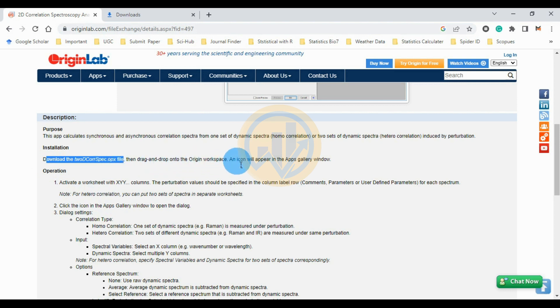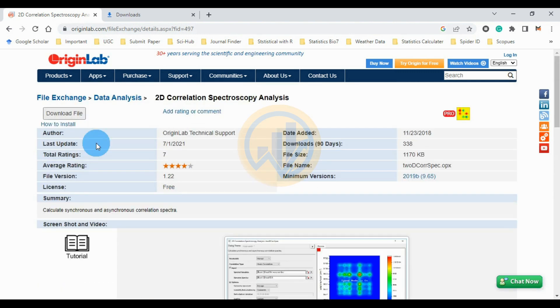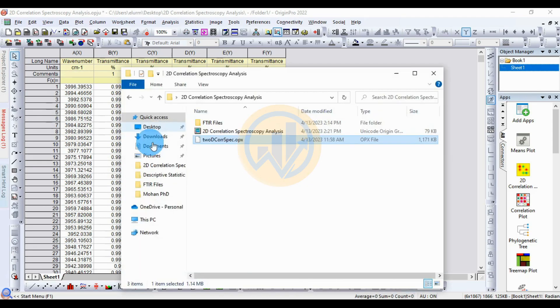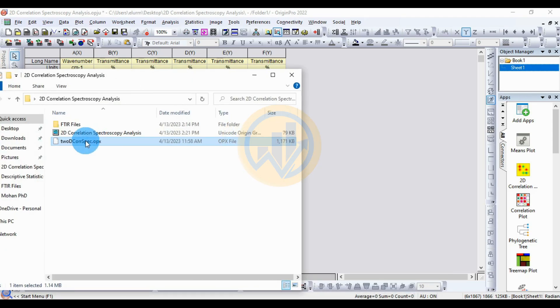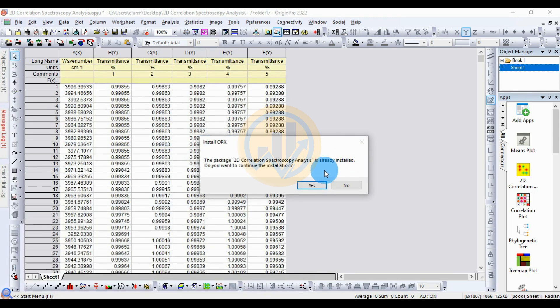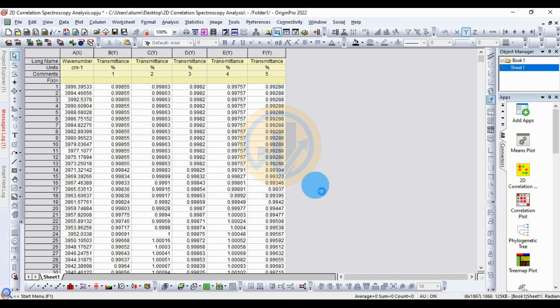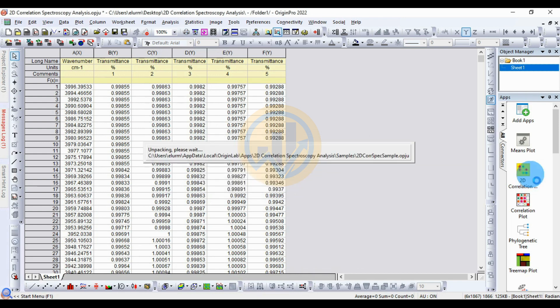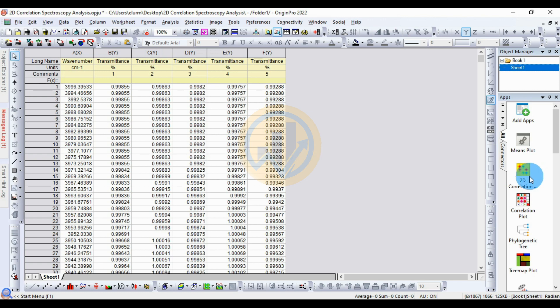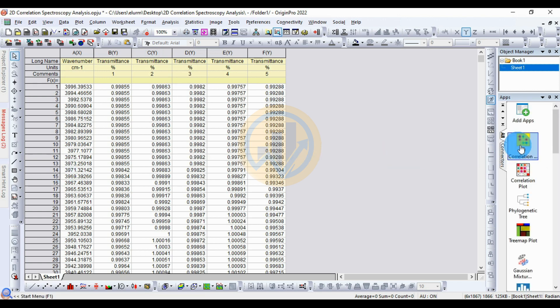The icon will appear in the app gallery window. I already downloaded the file, so go to the download location. Drag and drop the file into the ArginBro workspace. I have already installed this file. Click the OK button to install the 2D correlation spectroscopic analysis app. The installation is now complete.